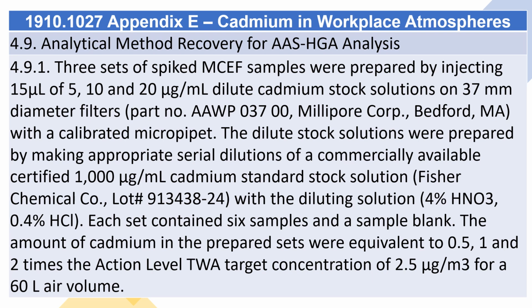Each set contains 6 samples and a sample blank. The amount of cadmium in the prepared sets were equivalent to 0.5, 1 and 2 times the action level TWA target concentration of 2.5 micrograms per cubic meter for a 60 L air volume.